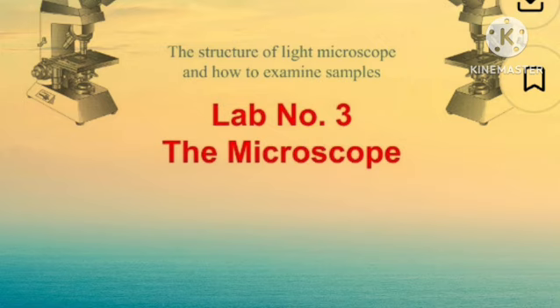And the next term is the light microscope. View the pictures. Very important are the various components that direct light to your eyes or to a digital sensor. So what are the parts of a compound microscope? You should be able to identify them.